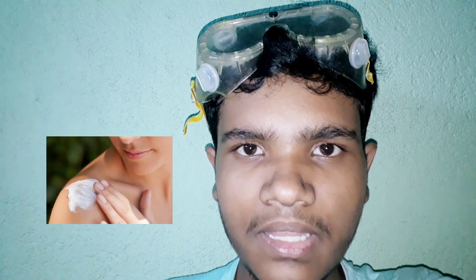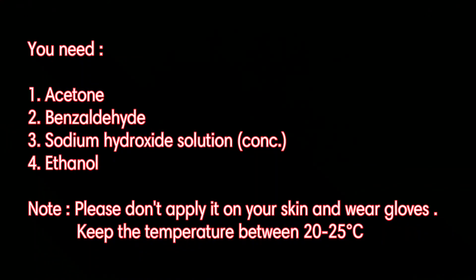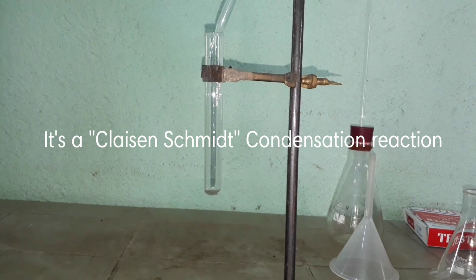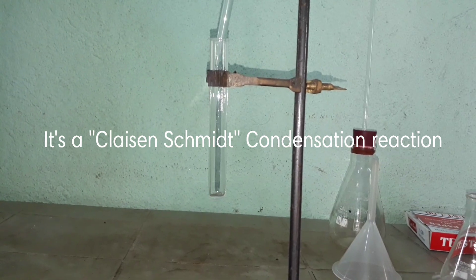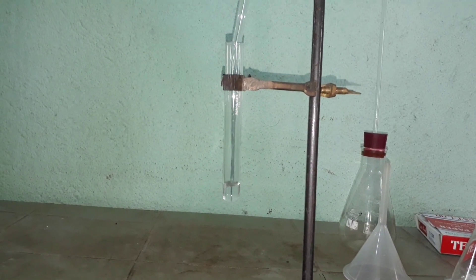Today I'm going to show you the making of di-benzyl acetone, which is the active ingredient of many types of sunscreen. All you need is acetone, benzaldehyde, sodium hydroxide, and some ethanol. About 1 ml of acetone is added in this test tube.